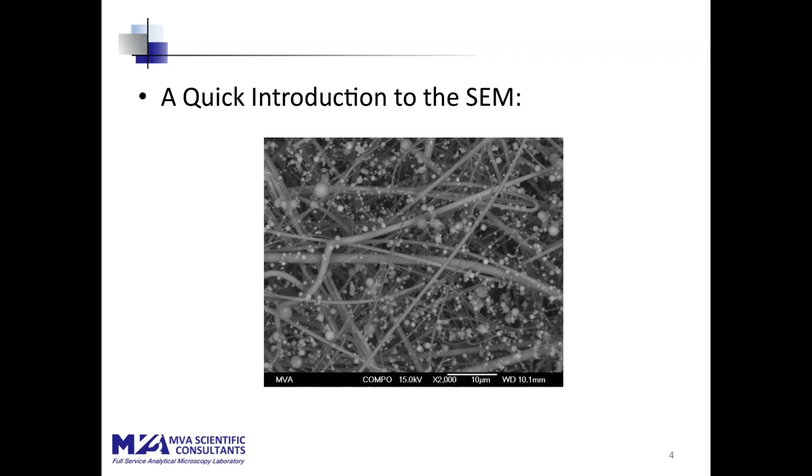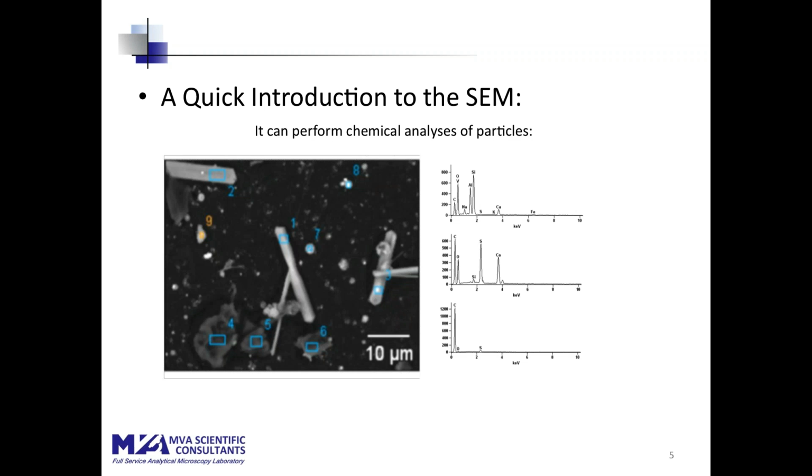Not only can the instrument take pictures, but it can provide analysis. It can tell you what the particles that you're looking at are. Here we see an example. This is a somewhat fuzzy field of view image of particulate from a different coal-fired power plant, and there's three different kinds of material present and identified here.